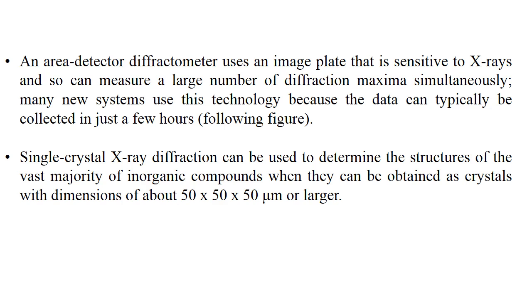Analysis of the diffraction data from a single crystal is formally a complex process involving the locations and intensities of many thousands of reflections. But with increasing advances in computation power, a skilled crystallographer can complete the structure determination of a small inorganic molecule in under an hour.